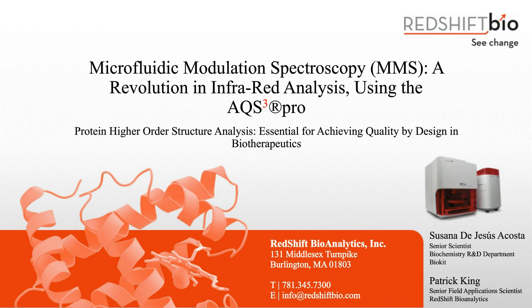I'm then going to go on to describe how MMS can be applied and fits very well into the protein workflow. I'll then give you some more details to the system itself and how it works. And then I'll hand over to Susana, who will give some more information as to the study in which we use microfluidic modulation spectroscopy to analyze a set of 13 very similar samples using secondary structure to discriminate between these to determine which of these candidates are viable or not viable for an ELISA screen.